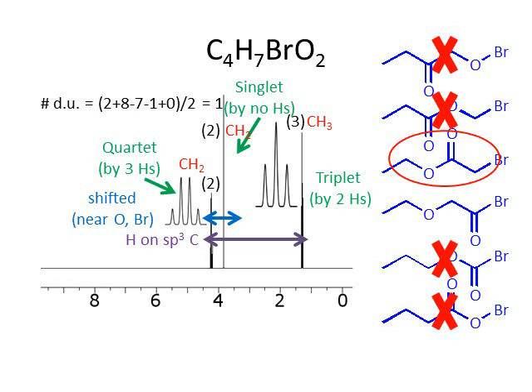But if we're systematic and we go through our spectra and we label everything and we see how that can fit together, and we look at all the possible combinations and eliminate the ones that can't work, we're going to end up with either the right answer or something that's pretty darn close to the right answer every time.